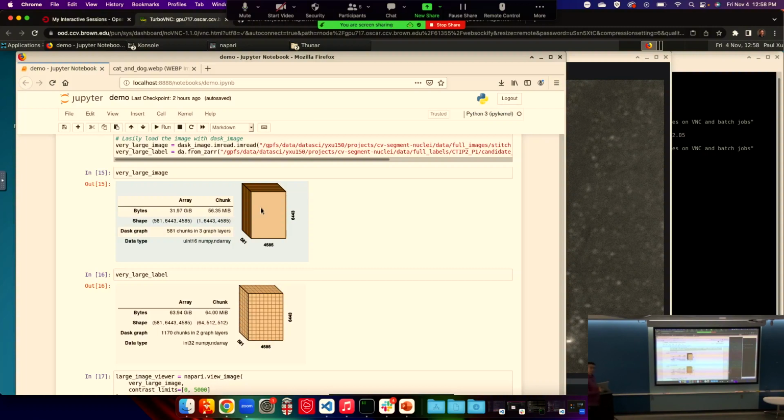As far as I know, we do have tools in Oscar that are able to render data sets that are way bigger than regular memory on a computer. We have been able to render in 3D data sets over 300 gigabytes using Oscar memory. So we're going to follow up with you after. And as a matter of fact, the next DSCoV is all.